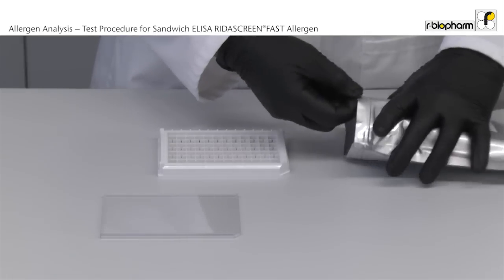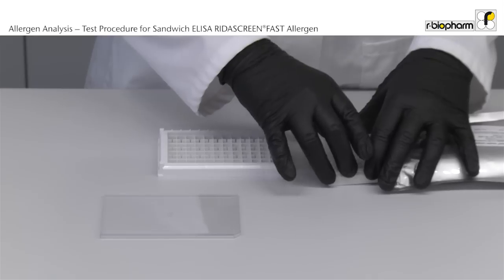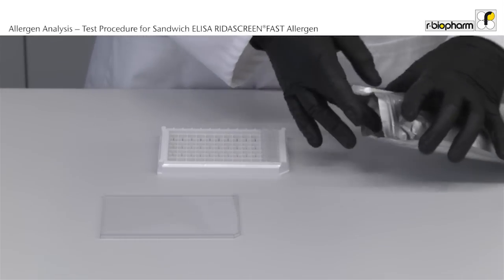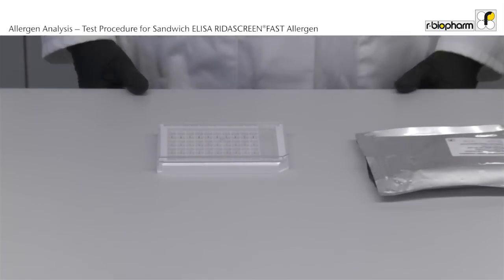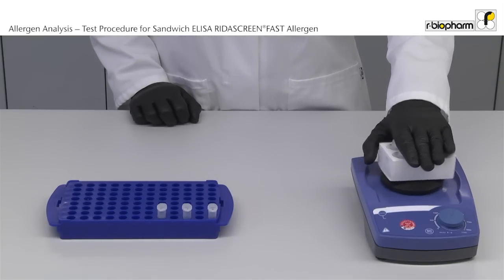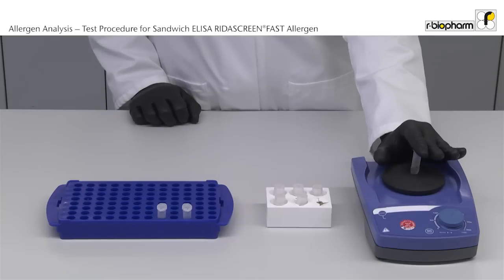After an hour, open the aluminium bag and insert a sufficient number of strips into the microplate holder. Leave unused strips in the aluminium bag so that the strips are not exposed. The sample is extracted according to the test kit insert. The supernatant from the extracted sample and the standards are mixed before use.